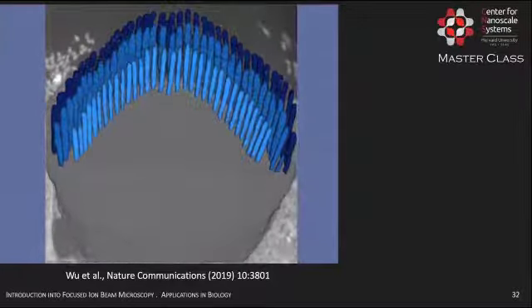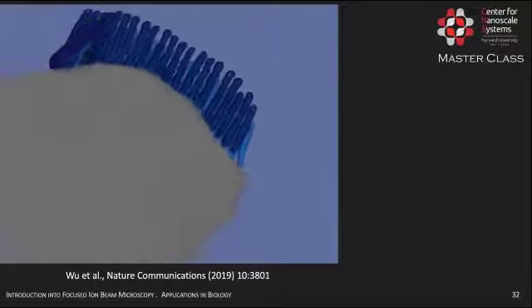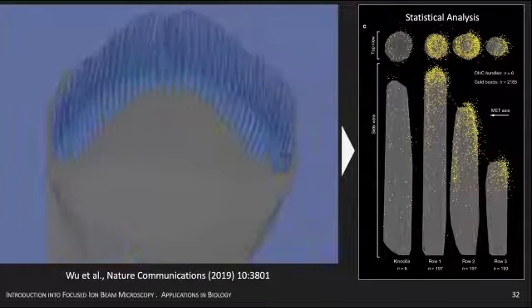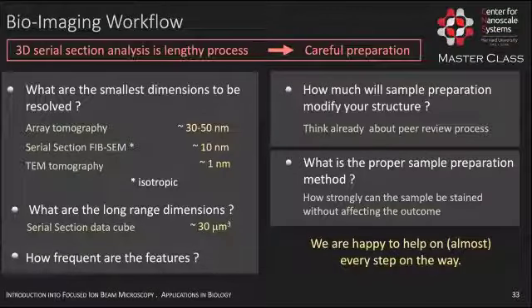So he could do this now on multiple samples, and as a result, he could get statistically meaningful data and understand where the major location of the protein is, which then translates into information on how it is contributing to the hearing process. So, to summarize, this process takes a little longer.